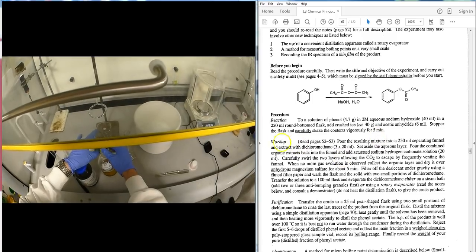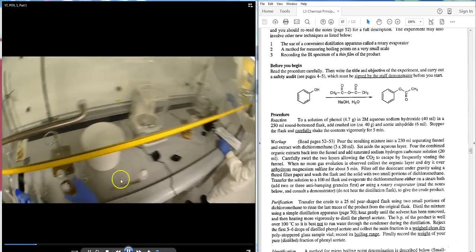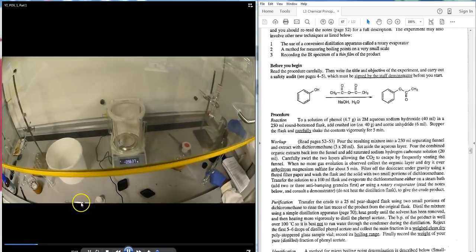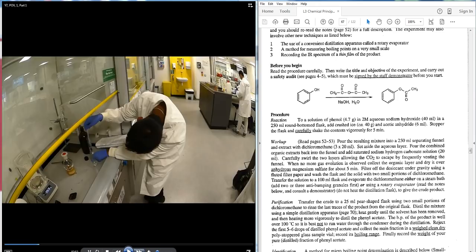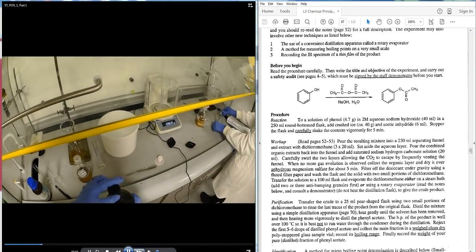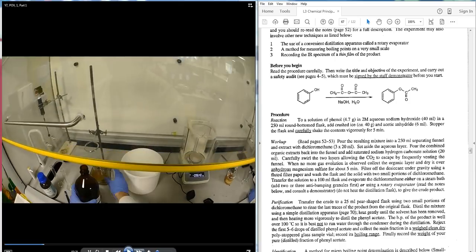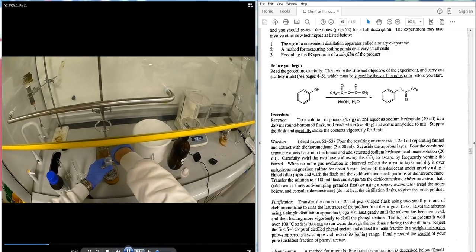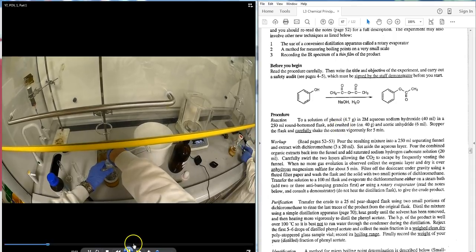The student is now going to take the sodium hydroxide. It is measured out into a measuring cylinder and then poured into the flask. A demonstrator is involved here; the sodium hydroxide is poured out and the student goes to eye level when pouring it into the flask.